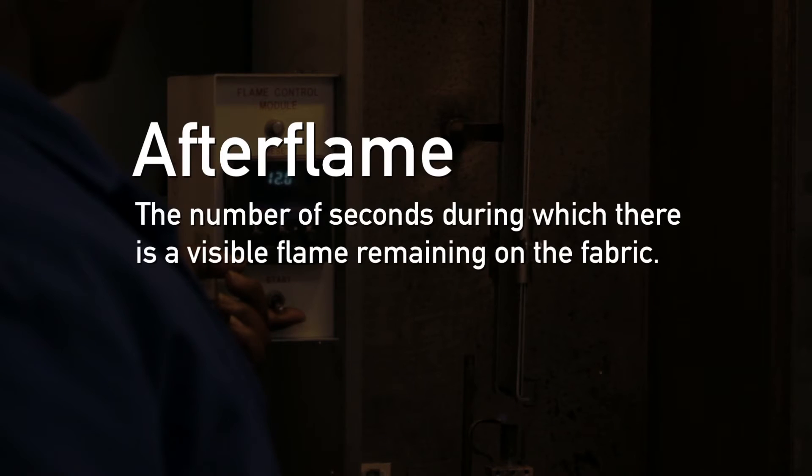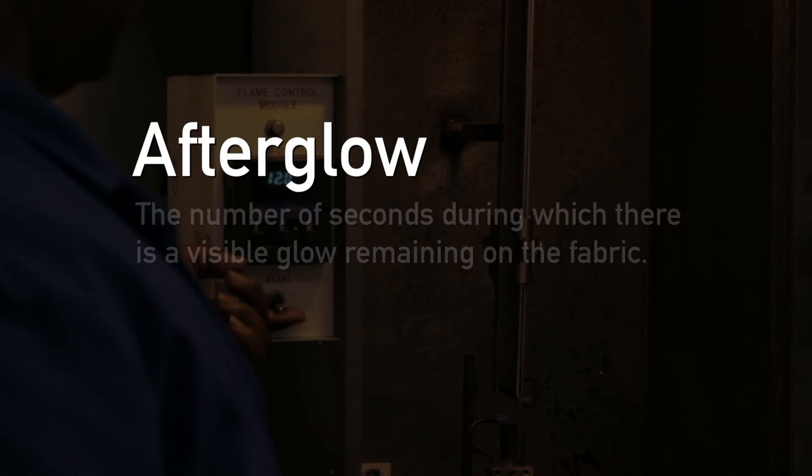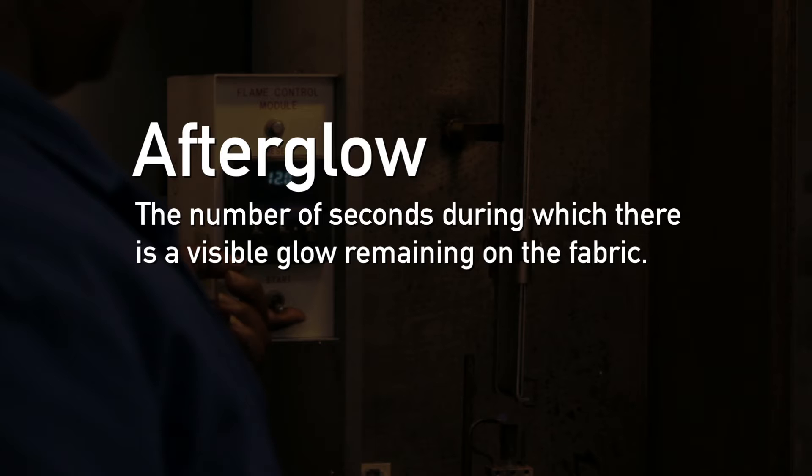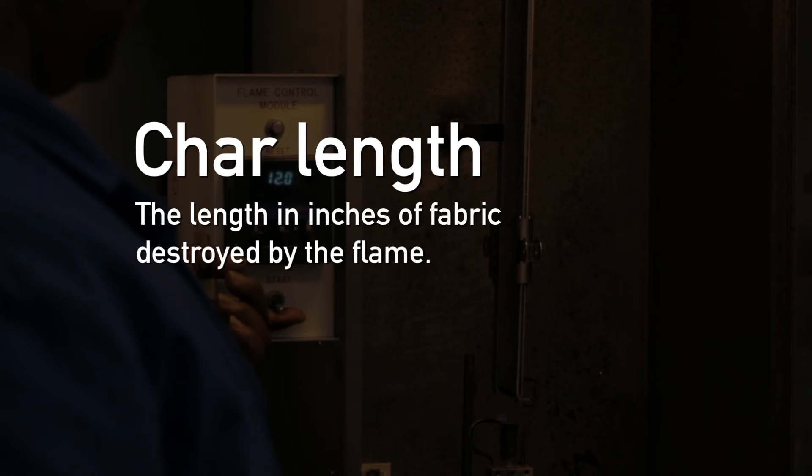After Flame: the number of seconds during which there is a visible flame remaining on the fabric. After Glow: the number of seconds during which there is a visible glow remaining on the fabric. And Char Length: the length in inches of fabric destroyed by the flame.